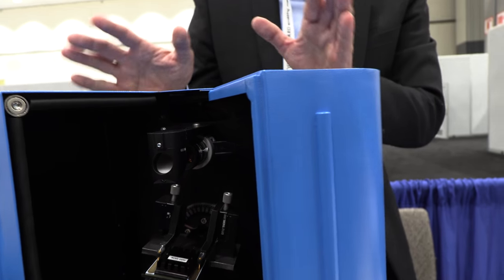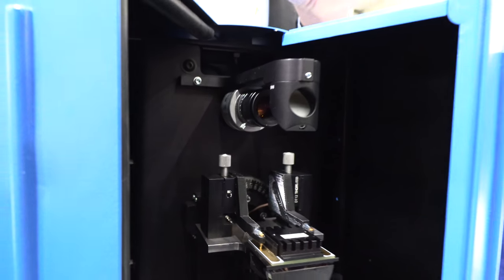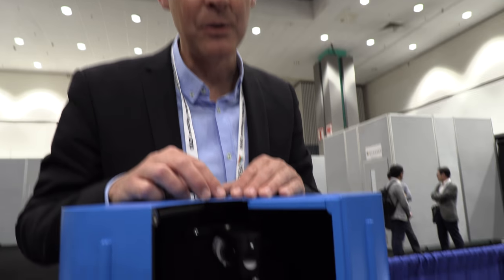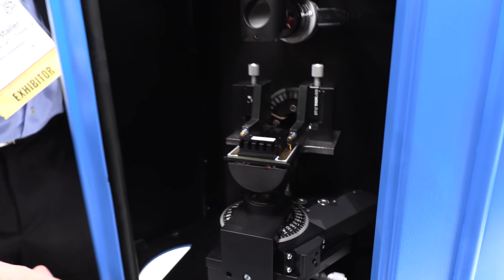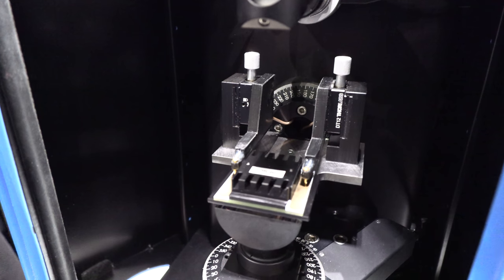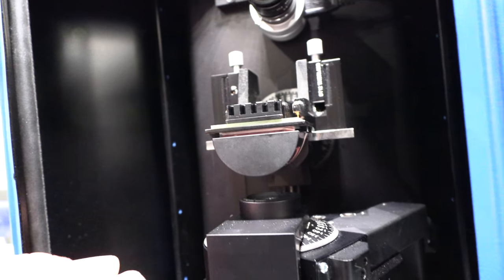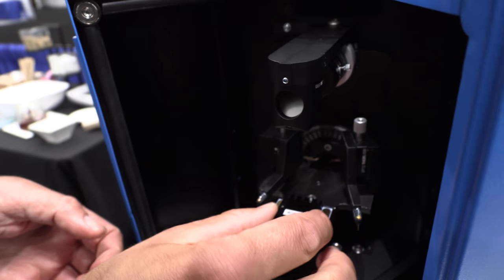And it's innovative that now this instrument can do optical excitation as well as electrical excitation. So what is each part doing right here? Right here we have a sample holder stage with a macro lens. So it's holding a sample of an OLED display? It's not a complete display. Basically it's an emitter layer, a layer of an OLED.